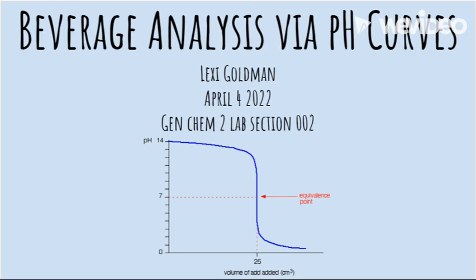For this lab report, I will be covering pH curves, specifically titration using pH curves to determine an equivalence point, which will then be used to determine the concentration of an analyte.